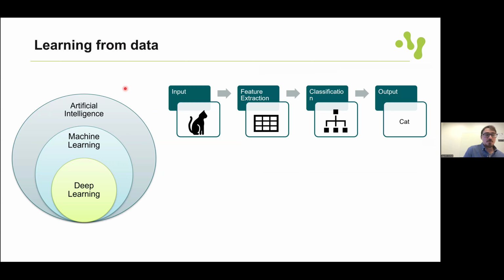So I went through a lot of different methods for segmentation and analyzing the image, but nowadays there's been an increase in methods that are based on deep learning. So what are deep learning or machine learning methods? Well, they all belong to the field of artificial intelligence, which are techniques that enable computers to mimic human behavior or human way of thinking. So the classical image analysis that I've shown you up till now usually falls into this artificial intelligence part.